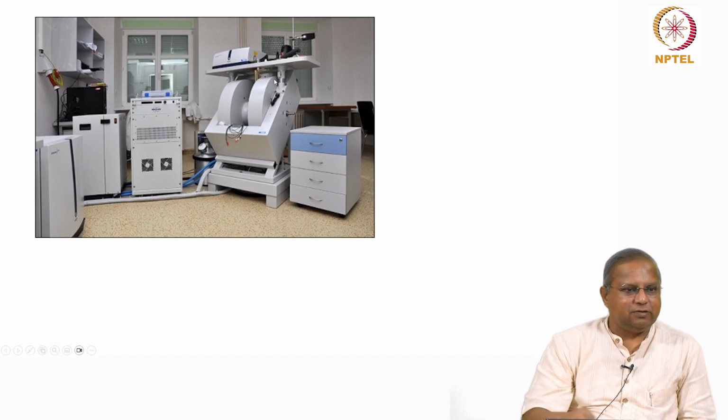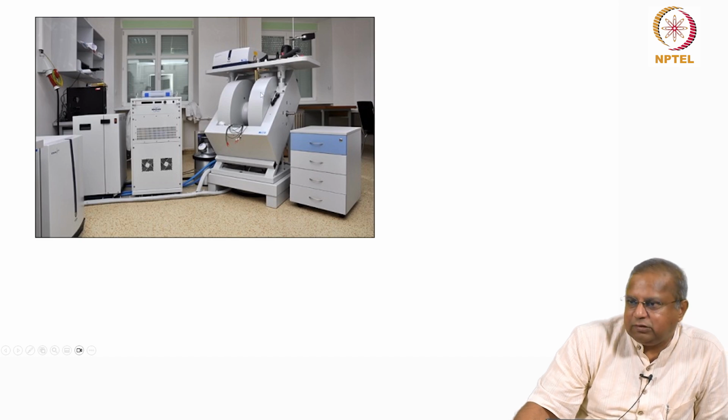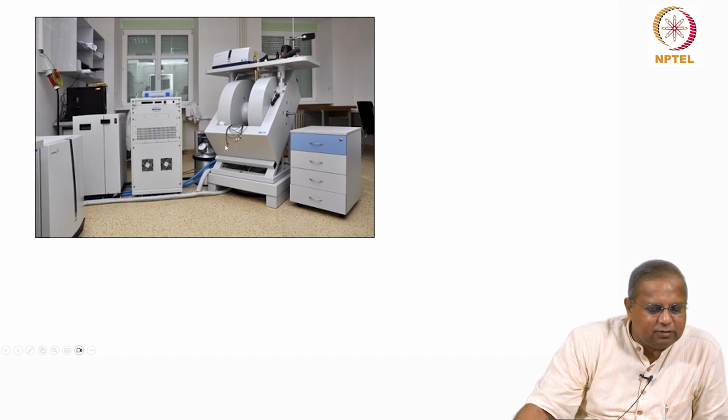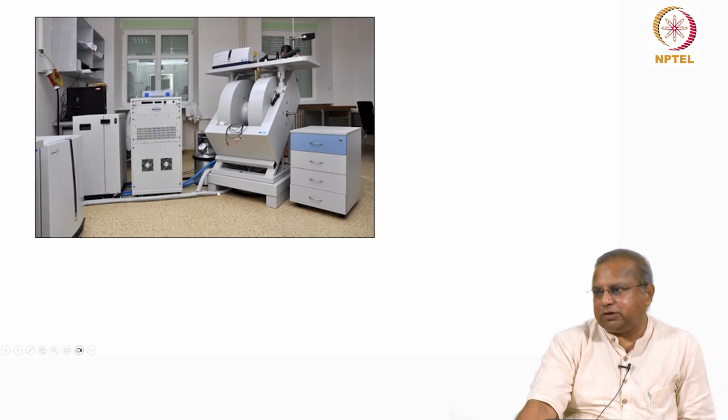That is a typical EPR spectrometer. That is how it looks. It is very similar to the one that we have in our SAIF, which is right across here. So, this is the magnet. And you see these huge things. These are huge electromagnets. 15,000 Gauss is very simple. I think this is much higher. I think this is our machine. Have I given you any reference? No. Most likely our machine or something very close to our machine. From that brochure I might have taken this. And our setup is very similar to this. Go and look at it. It's been many years since I looked at it.